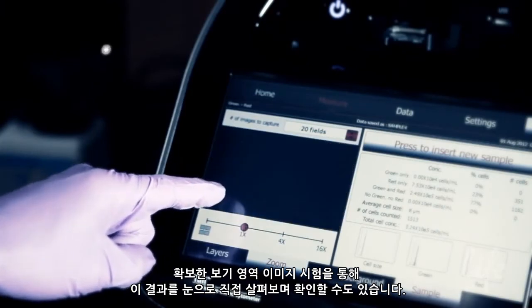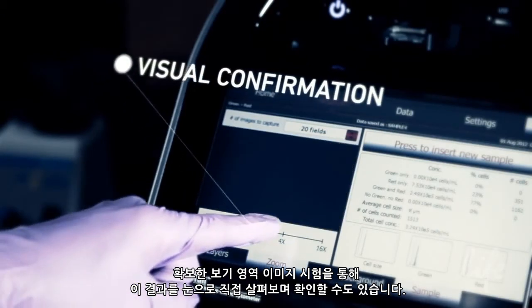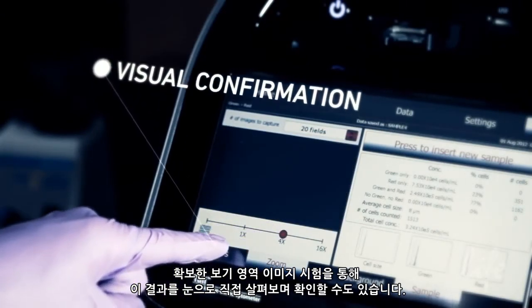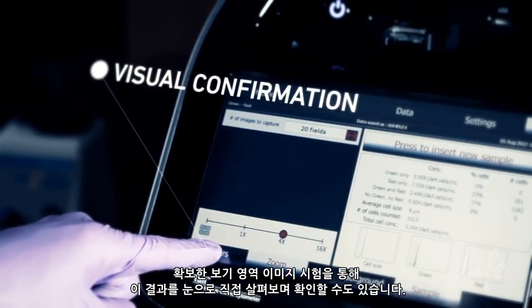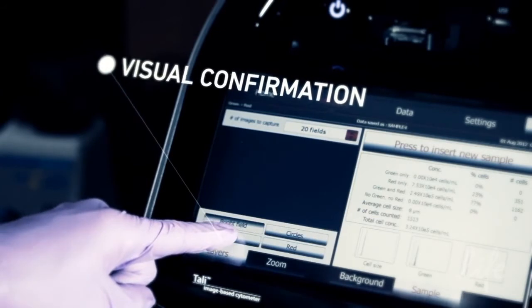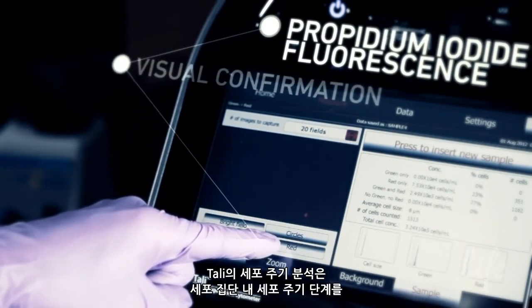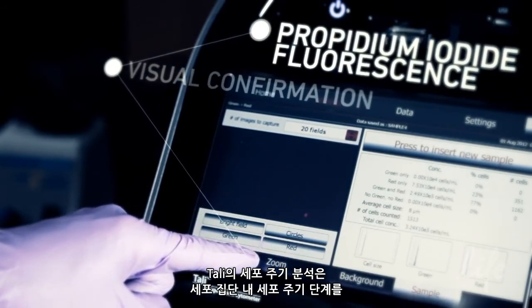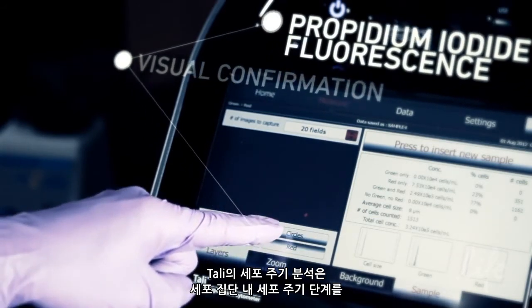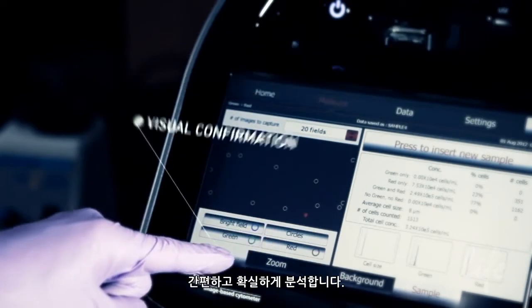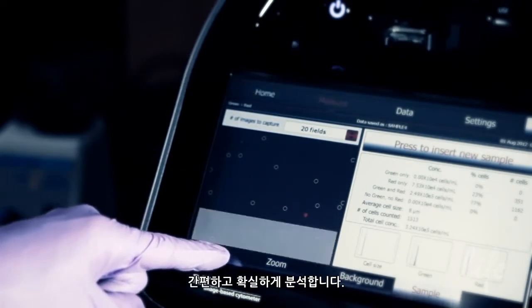The results can also be visually confirmed by examining the images of the captured fields of view. The cell cycle assay on the Tally allows simple yet powerful analysis of the stages of cell cycle within a population.